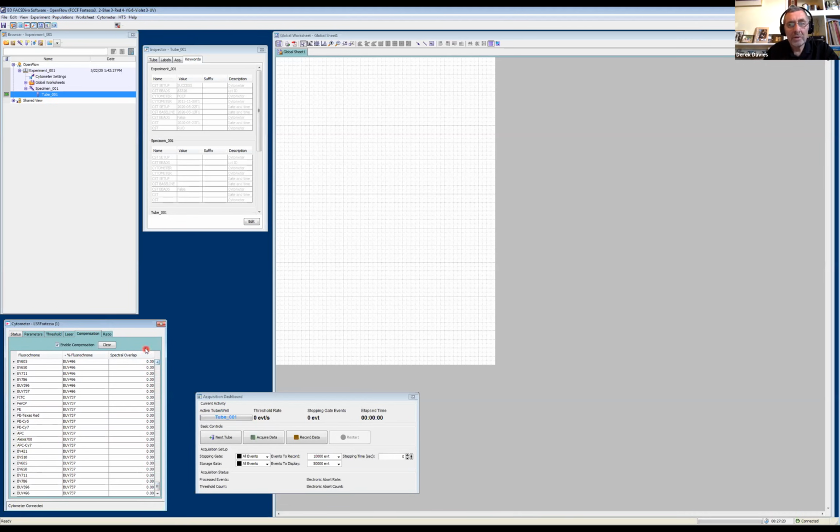Okay, so I always start with looking at that tab because it becomes important in thinking about how we're going to set the cytometer up. But now I'll hand back to Kathy and we'll actually set the page up for what we want to do today. Remember, we're just looking at single color fluorescence from some lymphocytes.